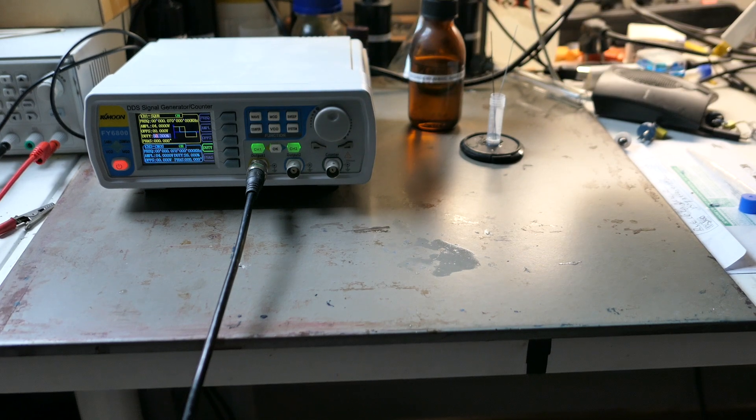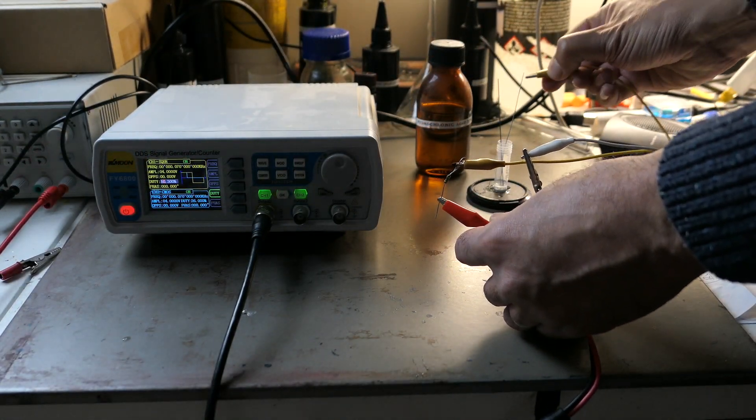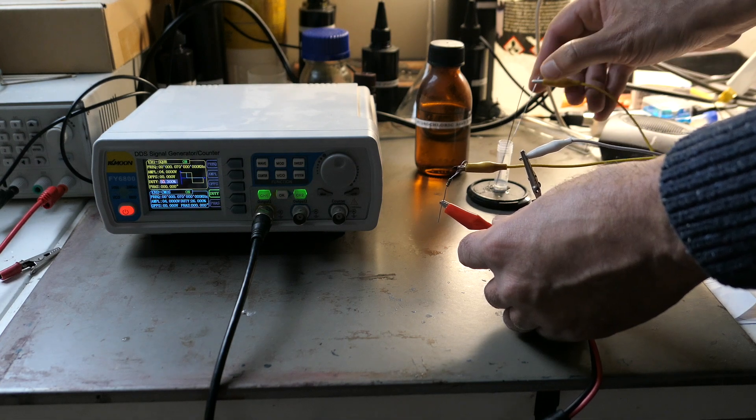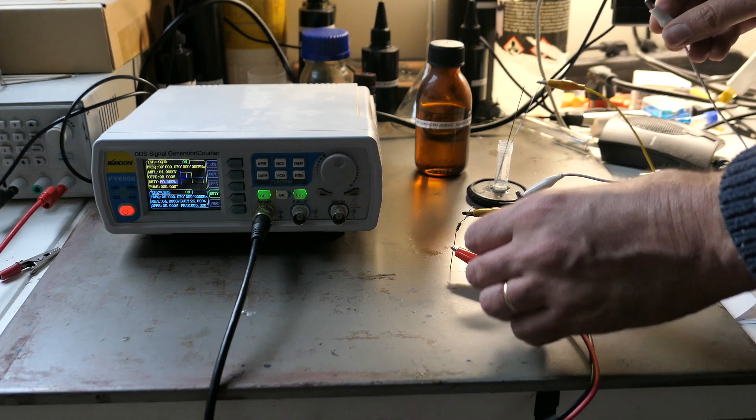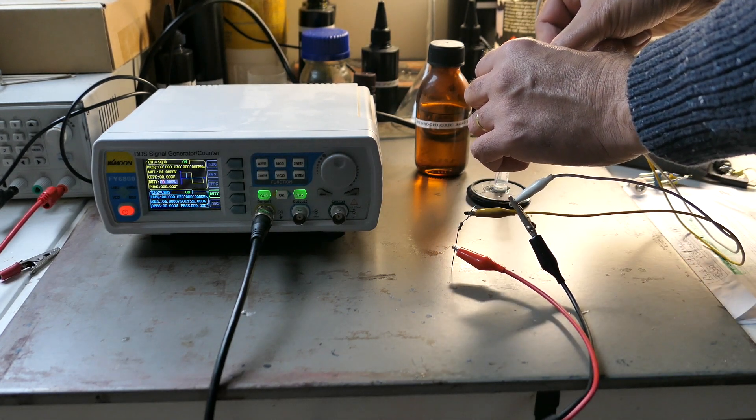I've set the frequency to 100 hertz for now, but based on what I've read in some articles it might be better to use a lower frequency like 10 hertz for better efficiency. For the amplitude I've initially set it to 2 volts but I'll increase it later once I see the voltage drop across the solution.